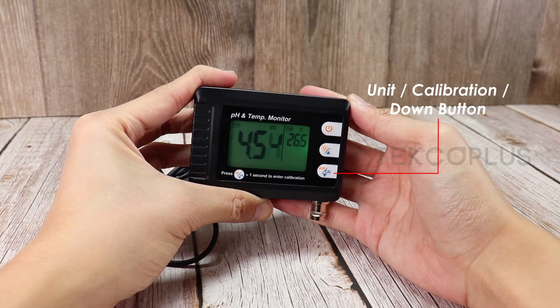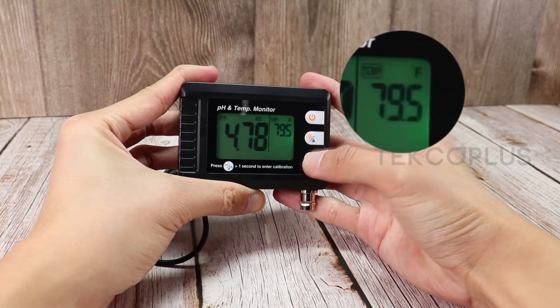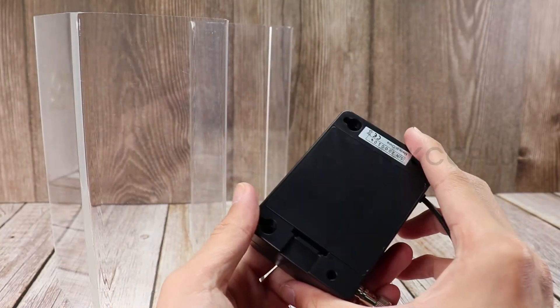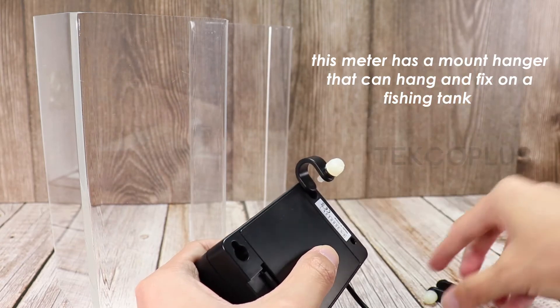Press the unit/calibration/down button to switch the temperature unit. Press the power button to turn on or off the meter. This meter has a mount hanger that can hang and fix on a fish tank, making it more convenient to use when measuring.